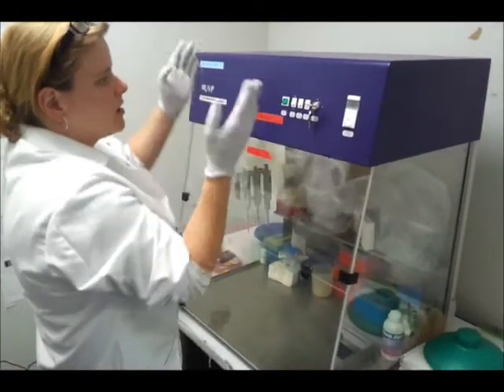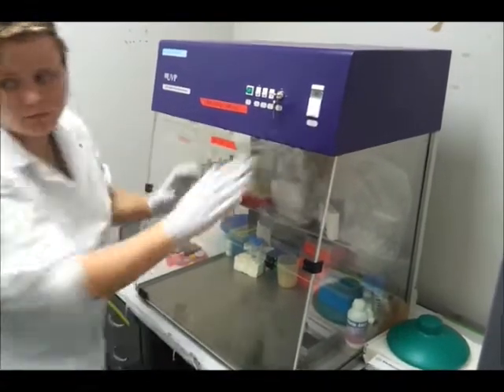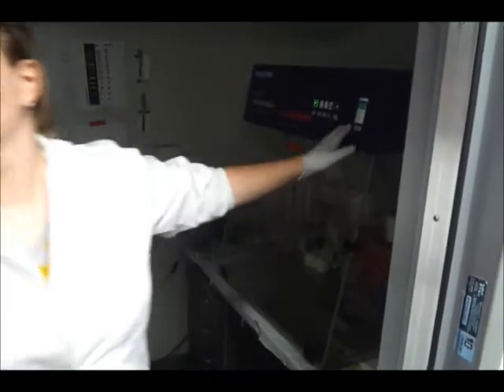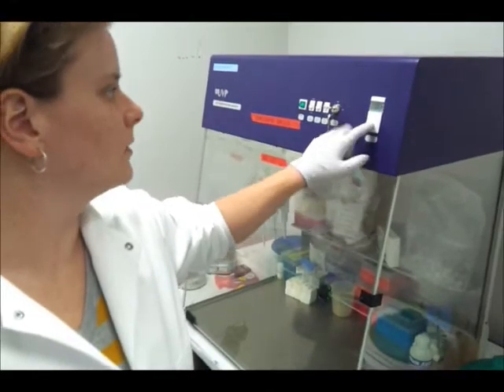a run. Turn the fans back on, and I'm going to press the UV light. Turn off this thing. And then close that up. And now we're going to go spin down the plate.